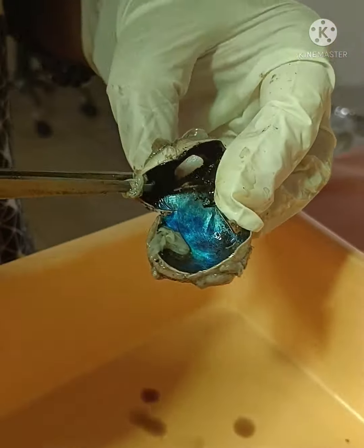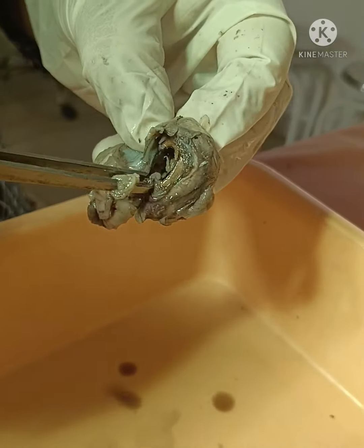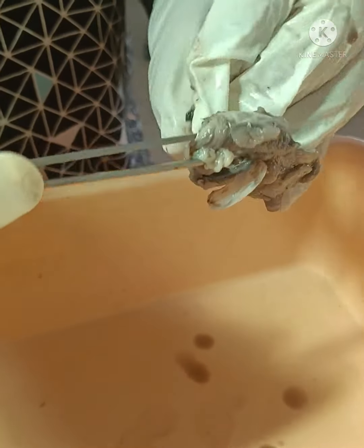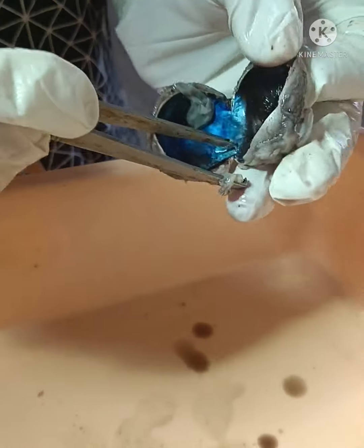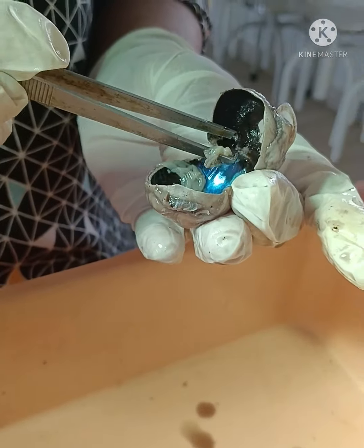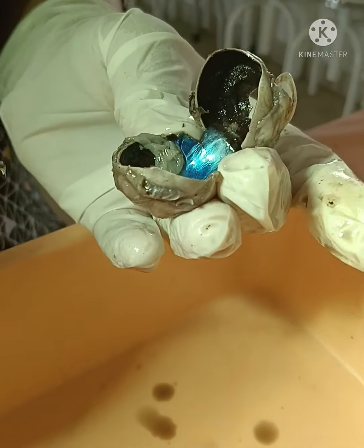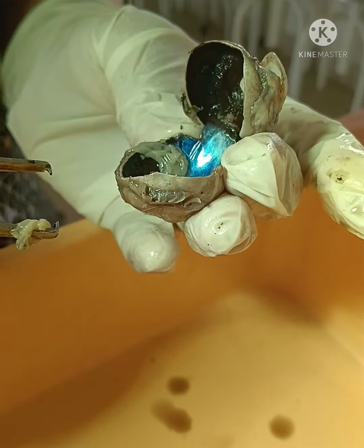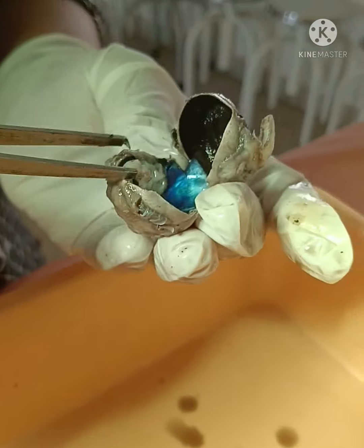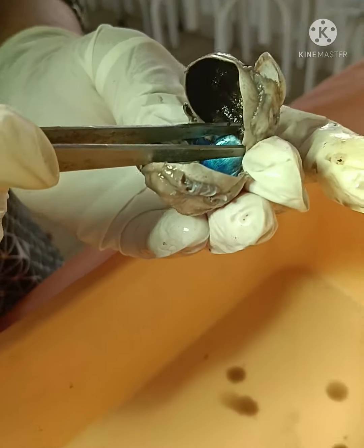Anteriorly we can see the cornea, and this gap is known as the pupil. The pupil adjusts the light rays: in bright light it contracts, and in dim light it dilates, with the help of the iris muscles. After the iris comes the ciliary body.